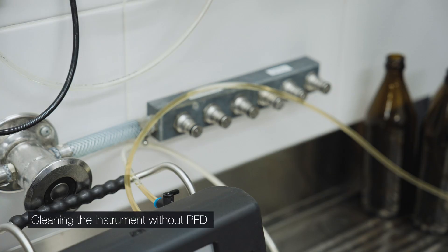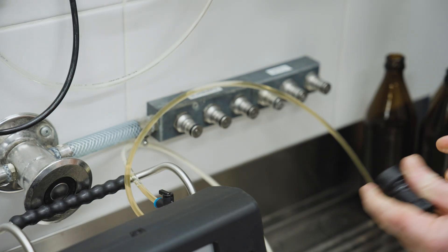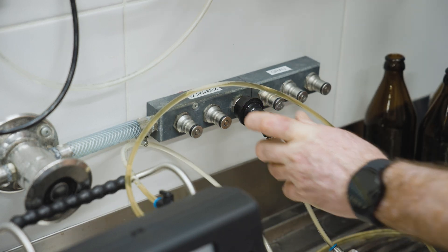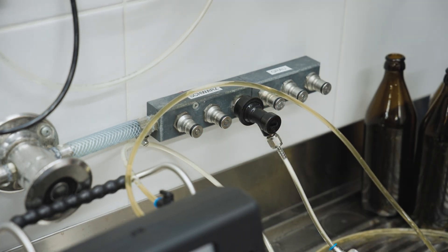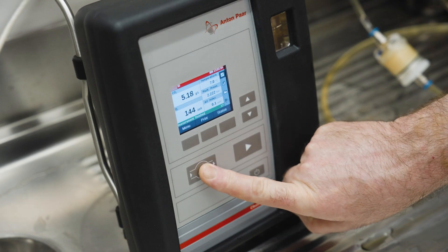When finished with measurements, rinse the instrument. Open the ball valve and connect a chlorine-free process or purified water supply. Open the water supply and rinse for at least 30 seconds.